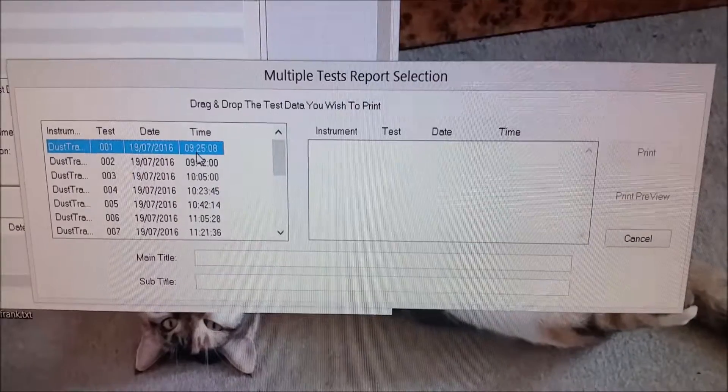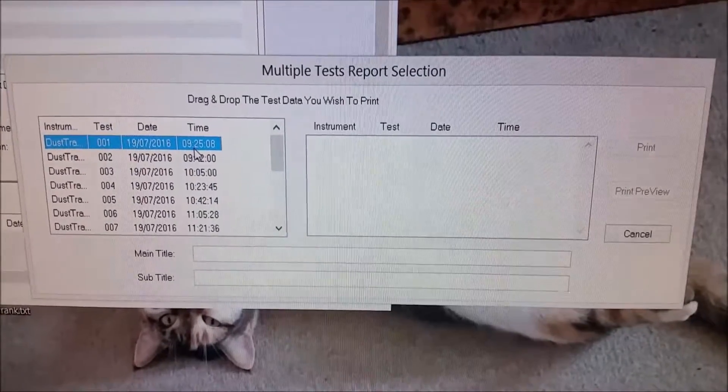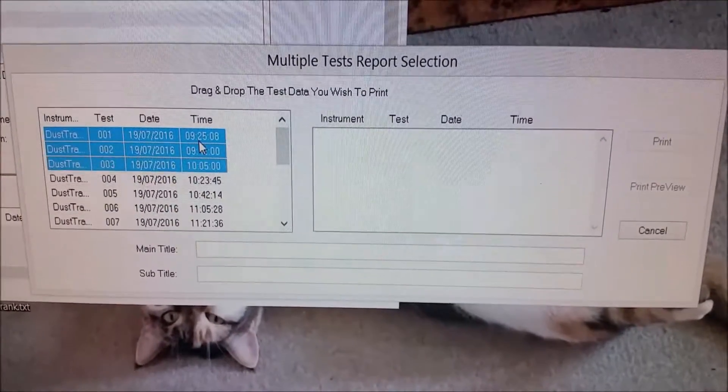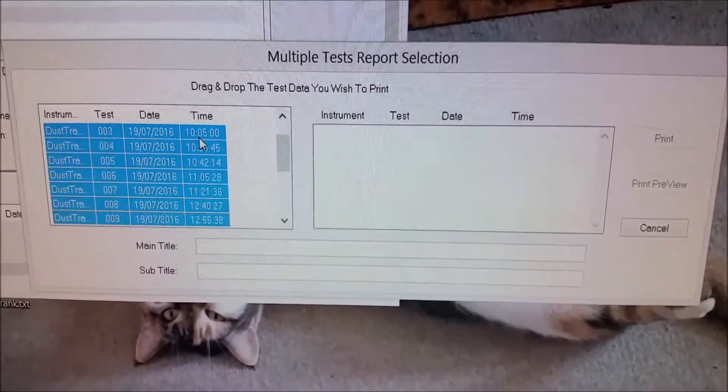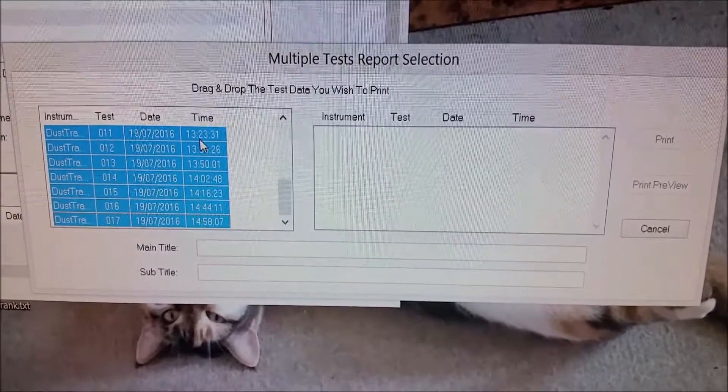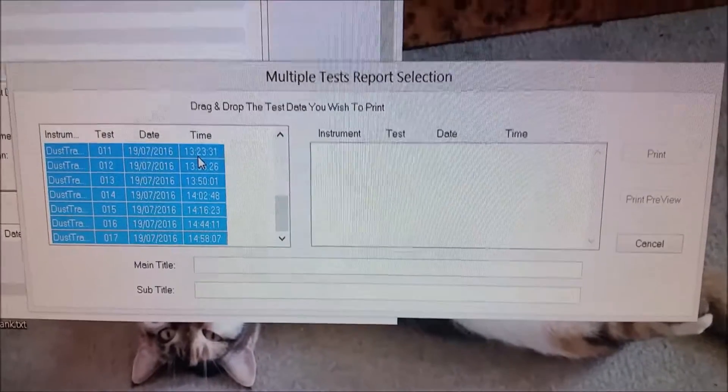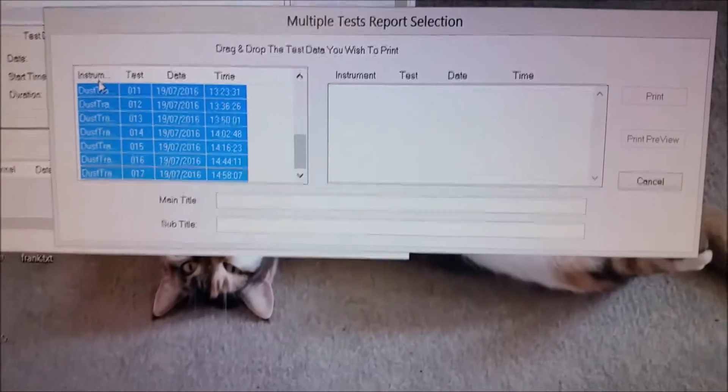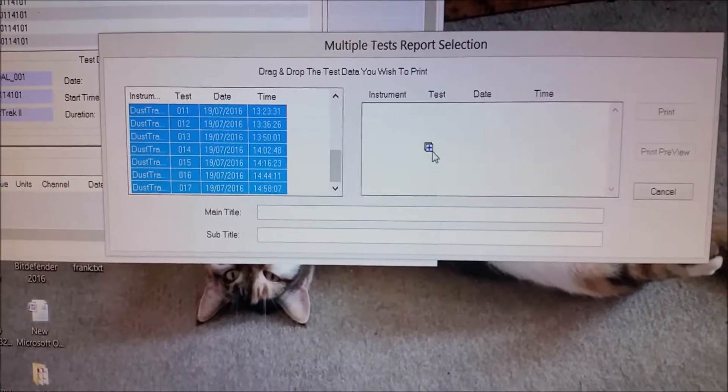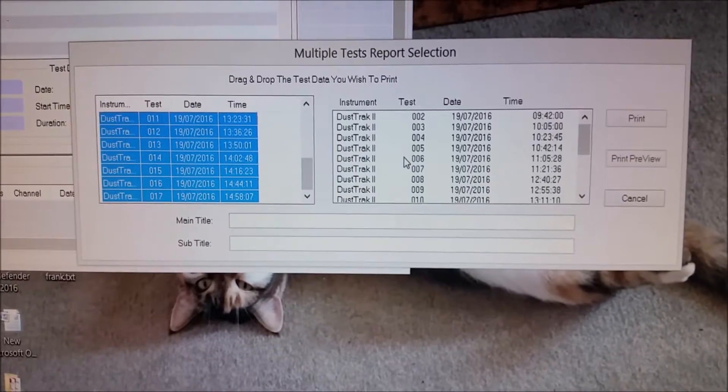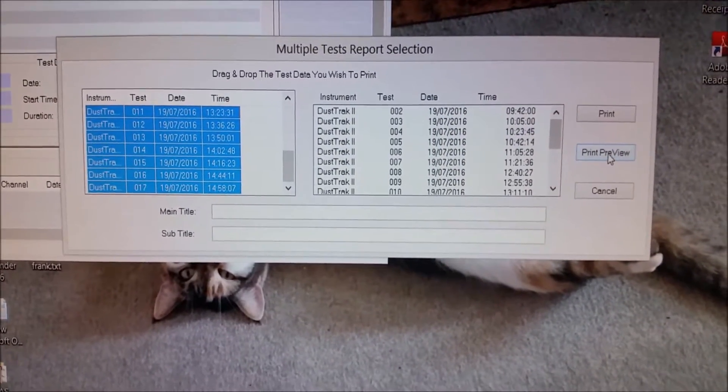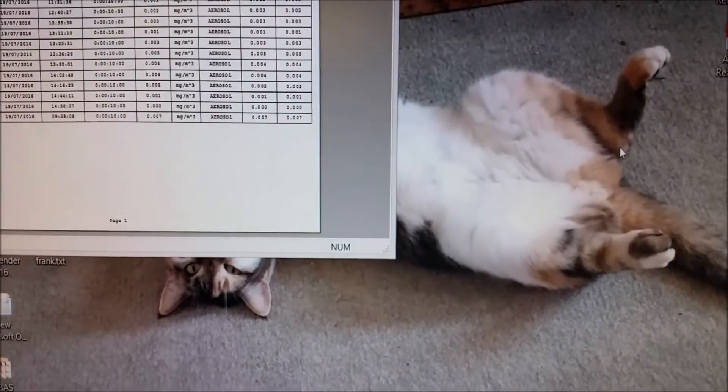So, we just hold down Shift and highlight all the files that we want to transfer across. We then drag to highlight it. And then we can print it.